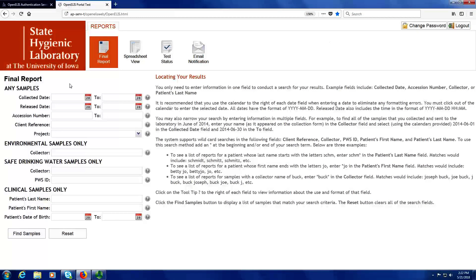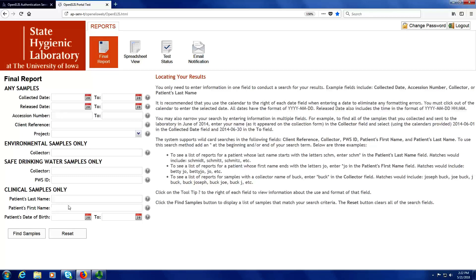Most web portal users will want to search by a collected date range for environmental or safe drinking water samples and also for animal or rabies samples. Whereas clinical users will probably want to search by either a collected date range, release date range, or the name of the patient.